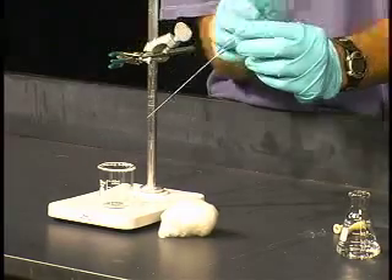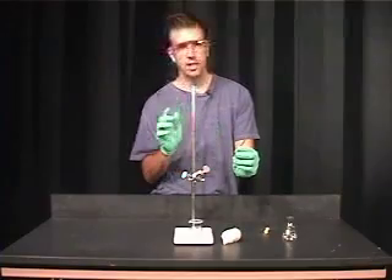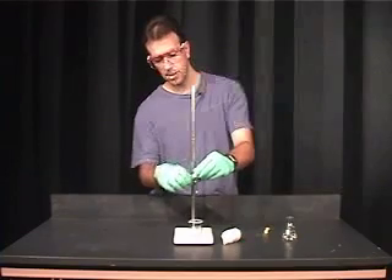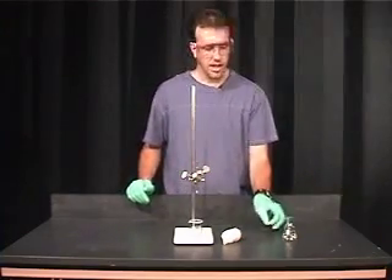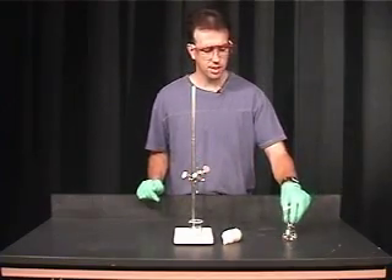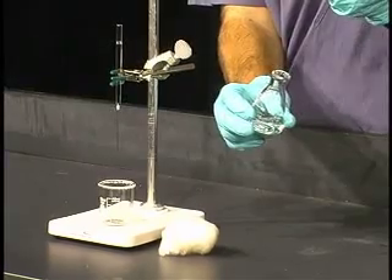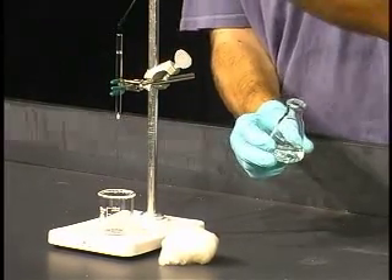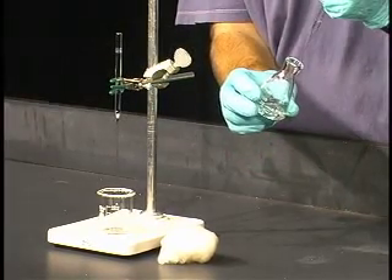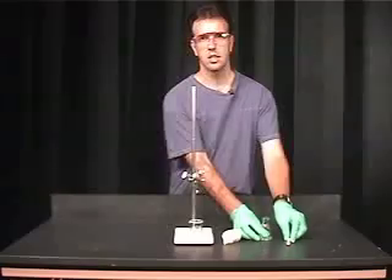What that's going to do is trap any particulates or solid material that may be floating in your solution, which we need to remove in order to do the polarimetry experiment. Set this in your clamp — clamp it loosely. Now we can simply transfer our solution. You will have a 10 milliliter solution of 95% ethanol that contains limonene. Simply take your Pasteur pipette and add it to the filter pipette, and let the solution filter into your polarimetry tube.